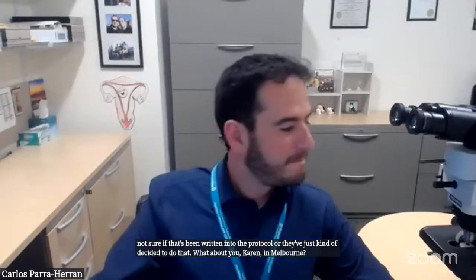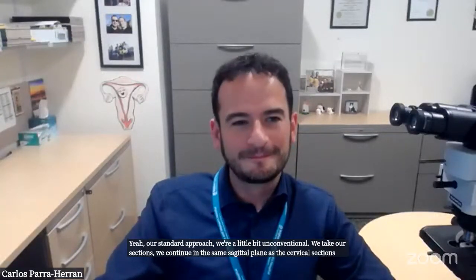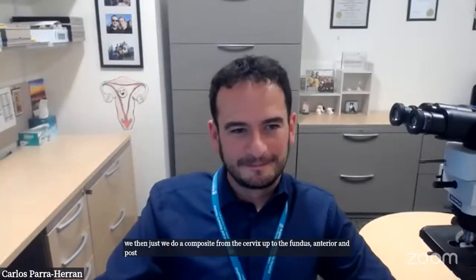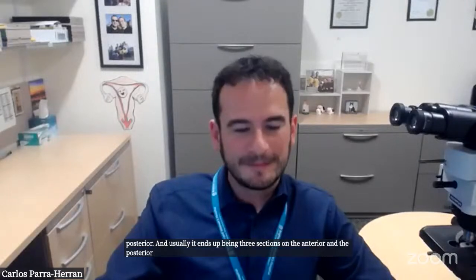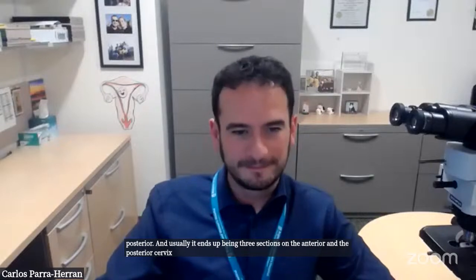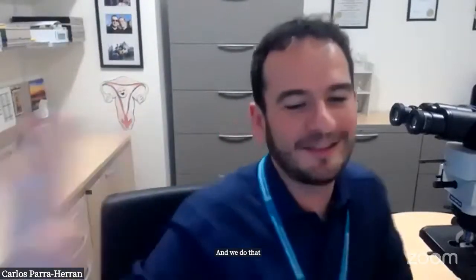Yeah, our standard approach, we're a little bit unconventional. We take our sections in the same sagittal plane as the cervical sections, and we do a composite from the cervix up to the fundus, anterior and posterior. Usually it ends up being 3 sections on the anterior and the posterior: cervix, isthmus, corpus, and at the end up to the fundus. I actually love that approach, let me tell you. And we do that across the board, benign and malignant.